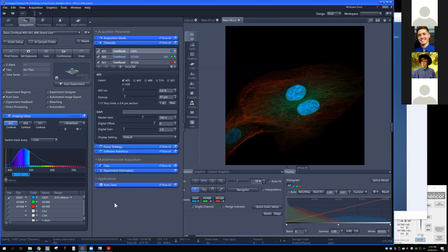And so because of that, if I decided that I wanted to make a change here and extend my DAPI into this range, if I take a look at the other channel, well, assuming it lets me do it, you'll see that it would encroach on this. So let me do it here with the green instead.